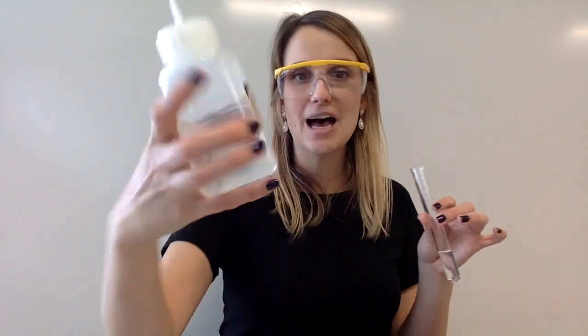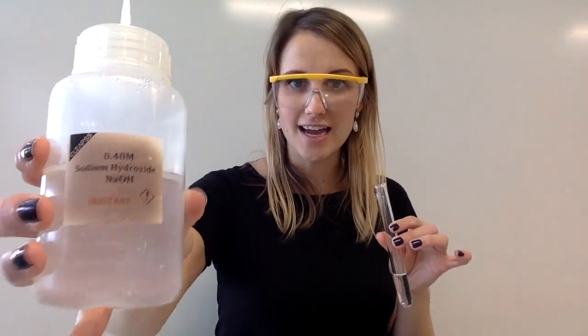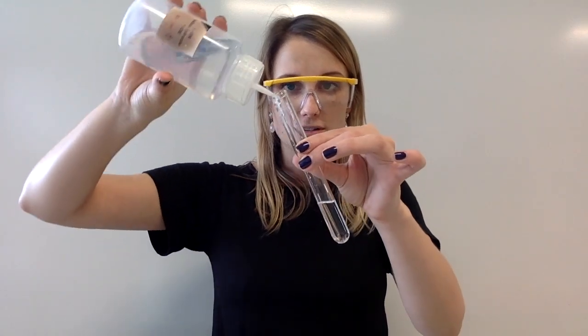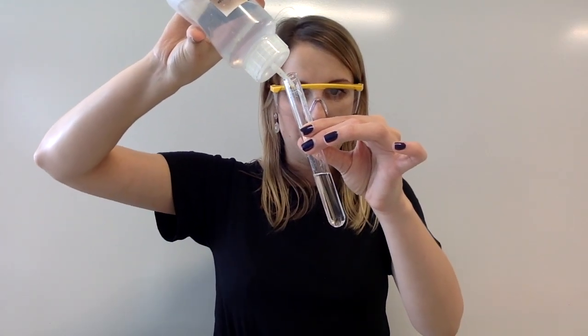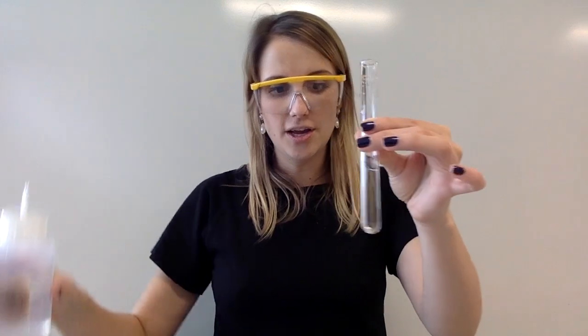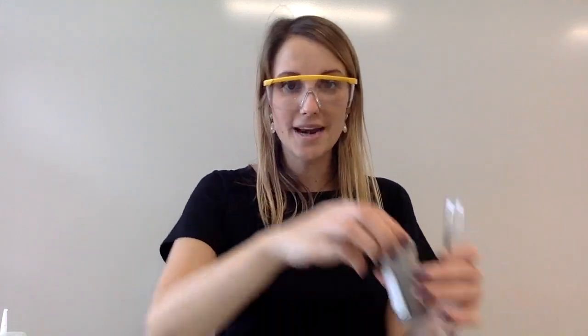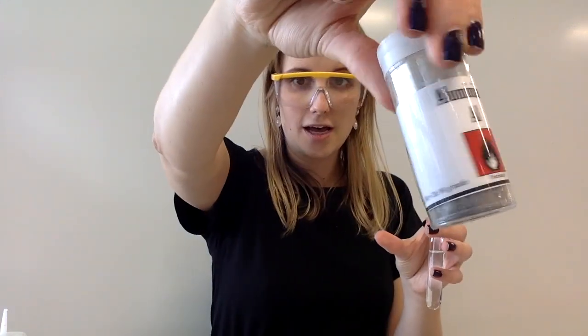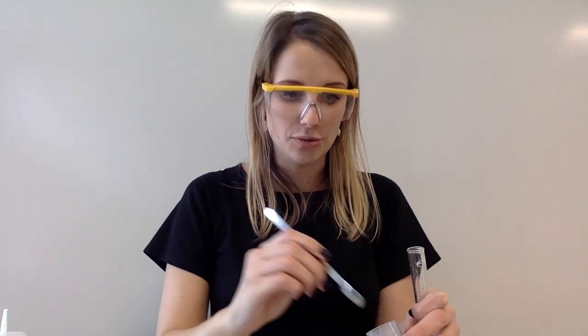The first thing that you need to do is add some sodium hydroxide. So sodium hydroxide goes into the mixture first, and this sodium hydroxide in combination with some aluminum causes that nitrate group to get reduced.